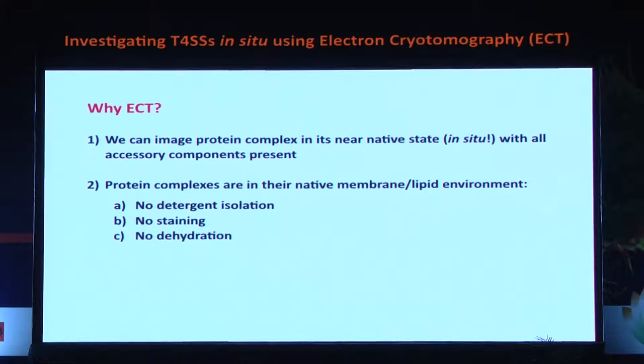So why ECT, or why electron cryotomography? We already introduced the advantage: we can start seeing molecules or molecular complexes inside cells, so you don't need to purify them. There's no need for detergent isolation, where sometimes the complex falls off. There's no need for any staining or dehydration. So we can look at the complexes inside the cell in their near-native state and in the right context.